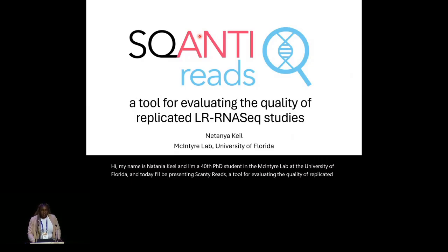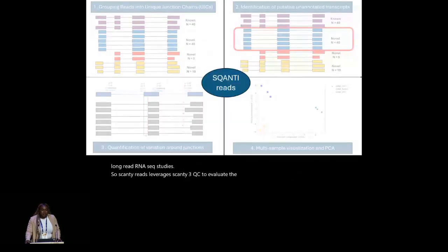SQANTI-reads leverages SQANTI-3QC to evaluate the quality of replicated long-read RNA-seq experiments. And today I'll focus on presenting 4 features of SQANTI-reads and how we apply them to real data sets.